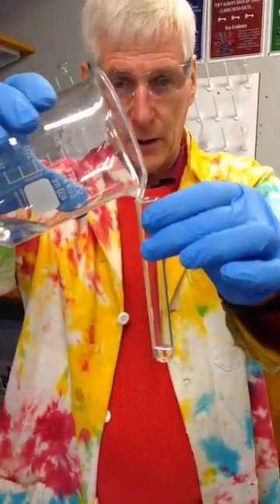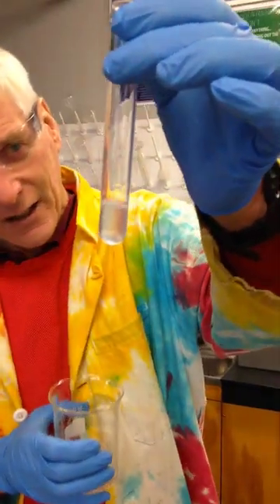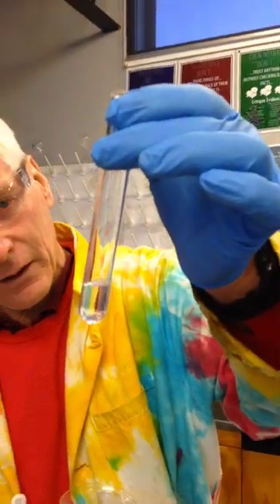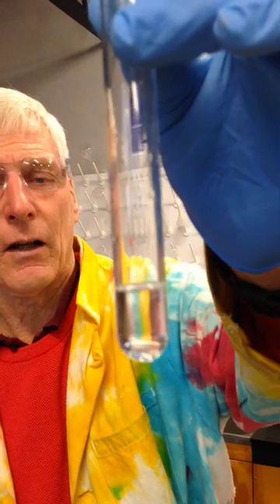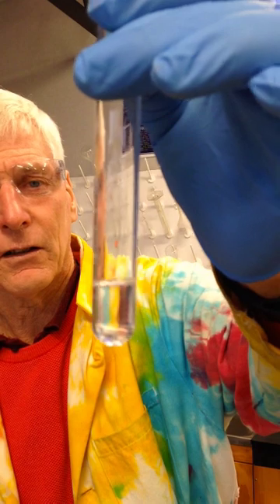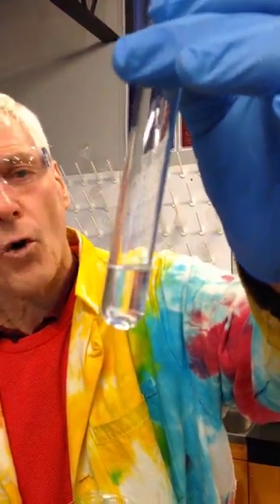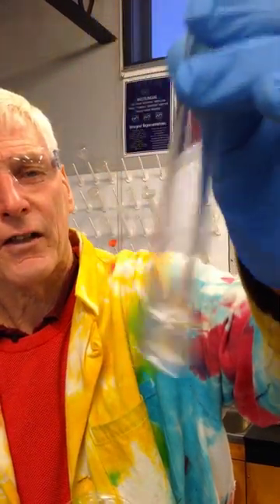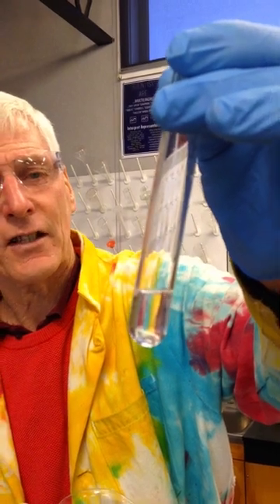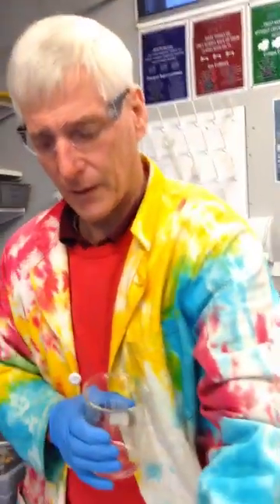And this time you'll see that it goes cloudy. Now, the hexane is dissolving in the ethanol. And you have to think about what might be causing that. It wouldn't dissolve in water, but it is dissolving in the ethanol. And that's really interesting, in fact. So there's no separate layers there.